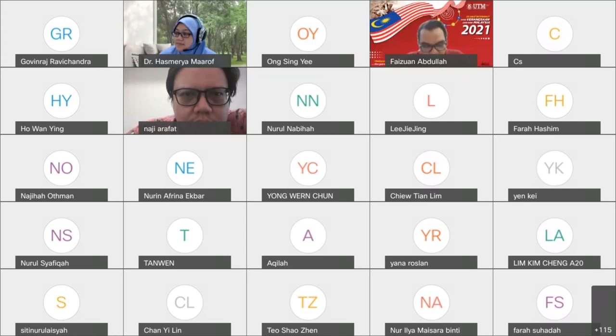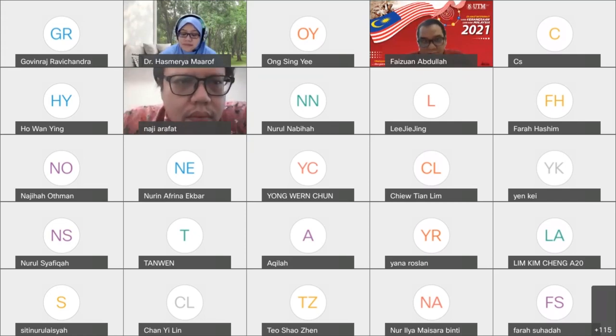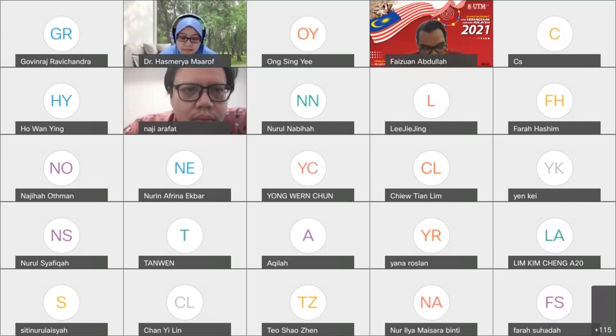It is the gravimetric determination of nickel. So, what is gravimetric? It is the traditional method of analysis. We determine our analytes based on the weight of the compound. We do the precipitation, and then we measure the mass, and based on some calculation, we can determine how much is our analyte.